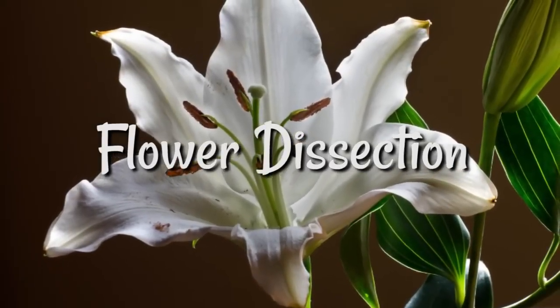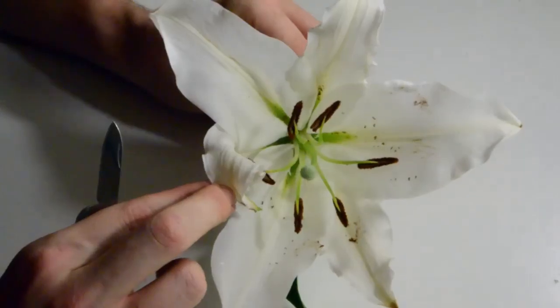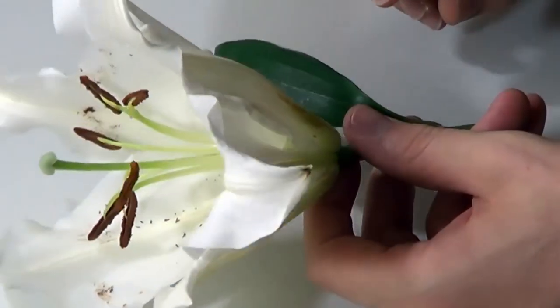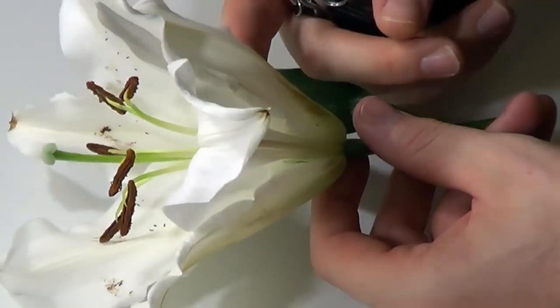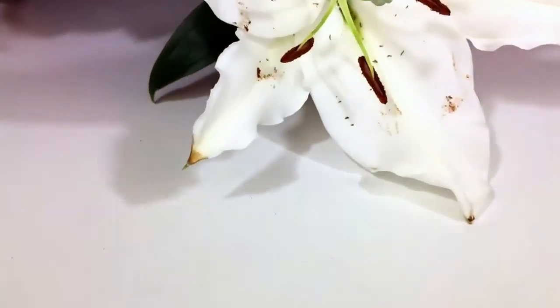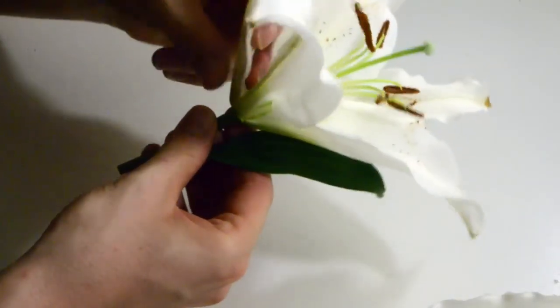For this flower dissection, we're using a lily because it's a really large flower that's got really obvious and very distinct reproductive parts. Now the first thing that we're going to do is remove this outer layer here. These are the parts known as the sepals. And you can see there, they are the first thing that comes out at the top of the stem of the flower.